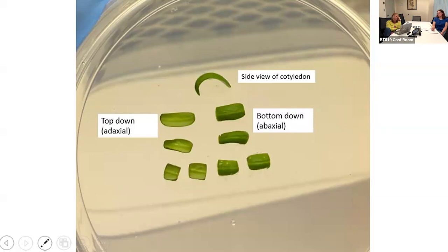We could get material, but it was a lot more work and not very efficient. We really had to ramp up the number of explants we used, and sometimes we had to repeat experiments. So we asked people to please not use vector systems with bar. Hygromycin works really well. I think it's an even tighter selection for tomato than kanamycin. So we stopped using herbicide selection a long time ago.